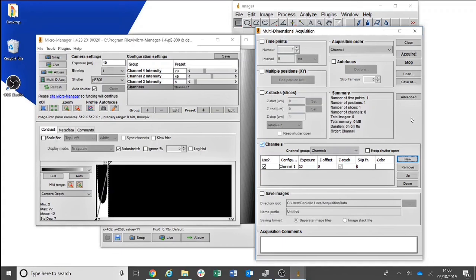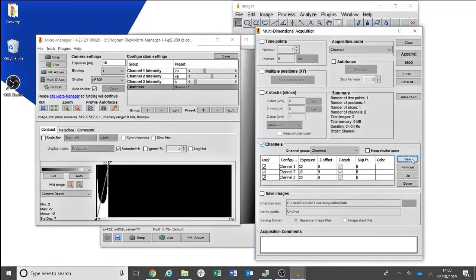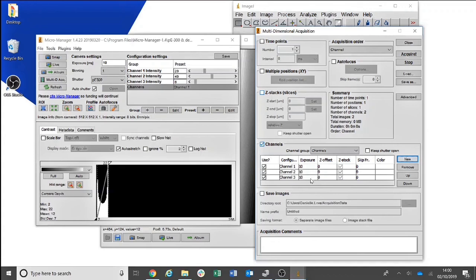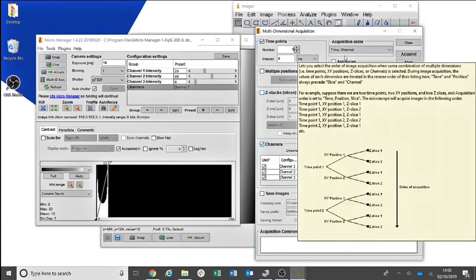To do a multichannel experiment, click New again and this will add the second channel. New again to add a third channel. These will illuminate at the intensity selected on the sliders. You can then adjust the exposure as required.